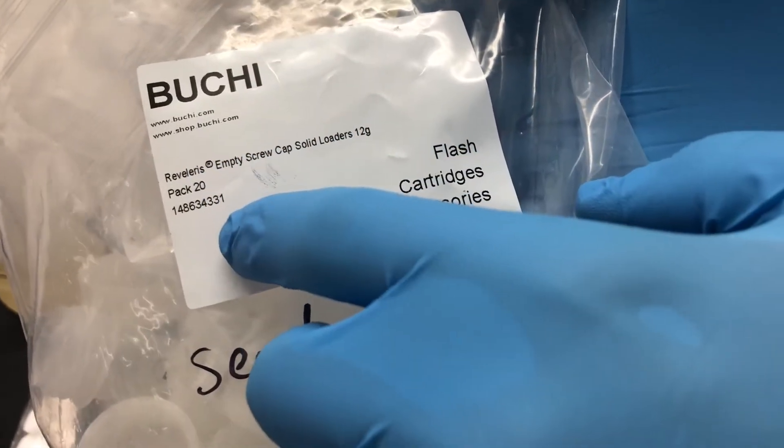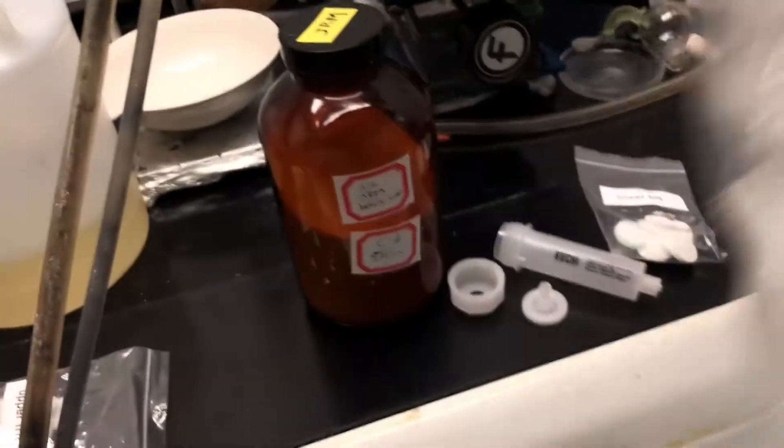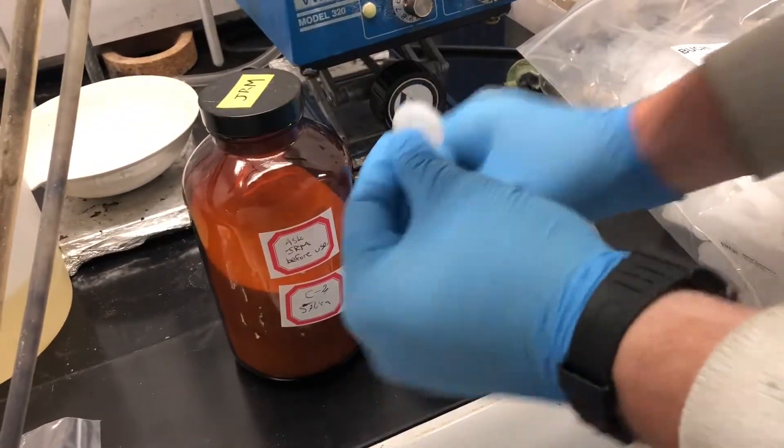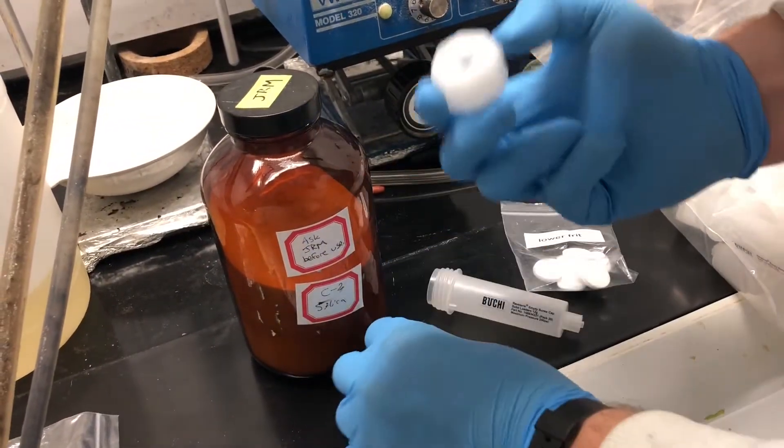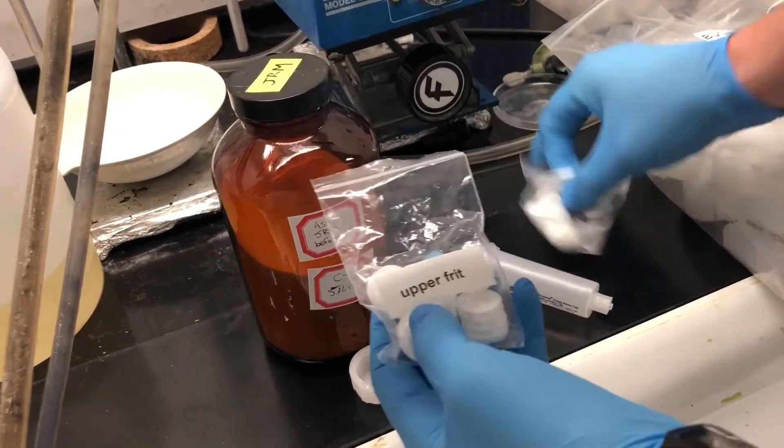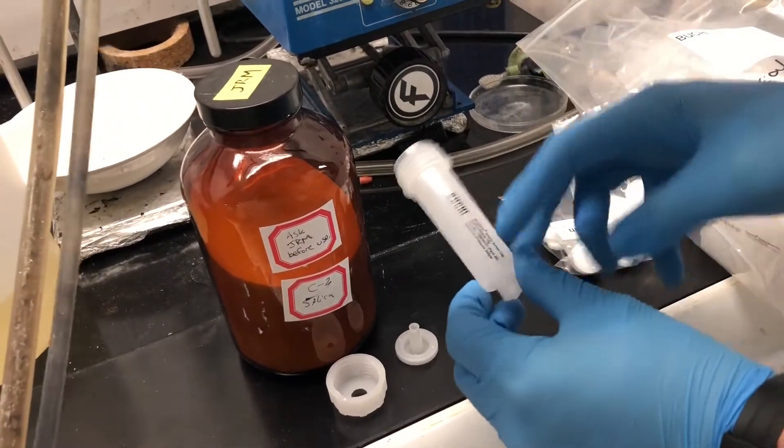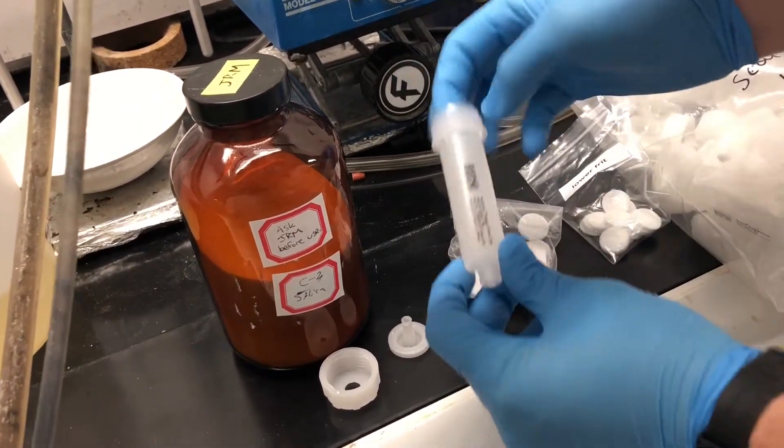We're using these Buchi 12 gram cartridges that come with their own top connecting piece adapter, the screw-in for the top, the cartridge itself, and an upper and lower frit. The lower frit is for down here, upper frit is for the top.